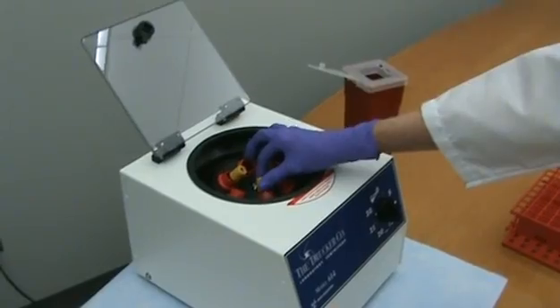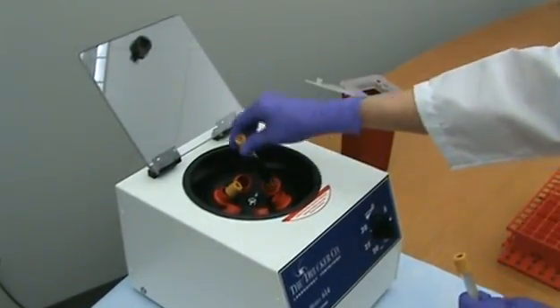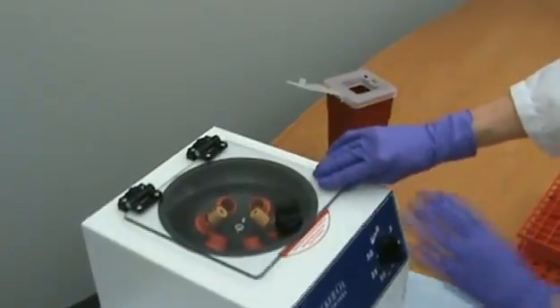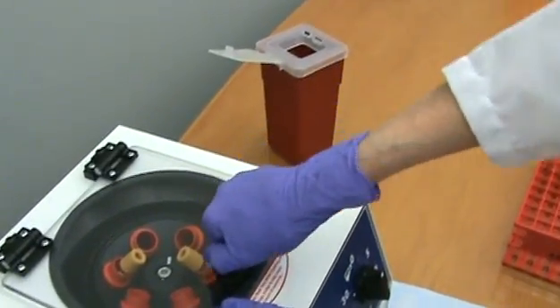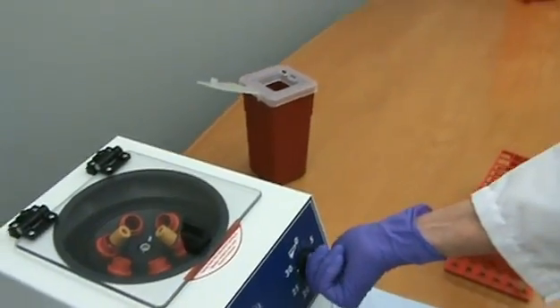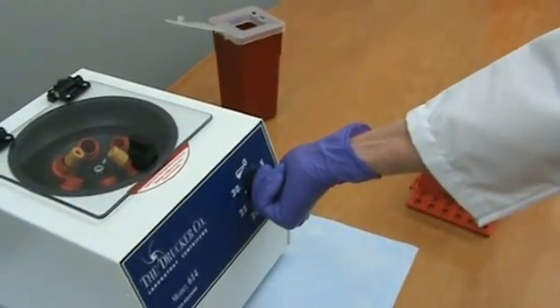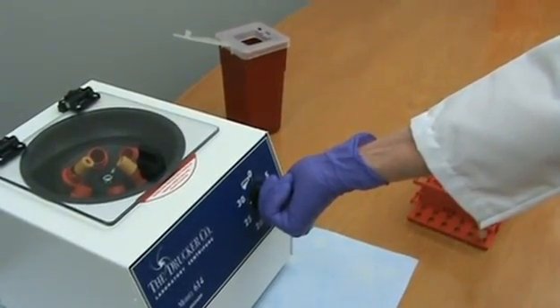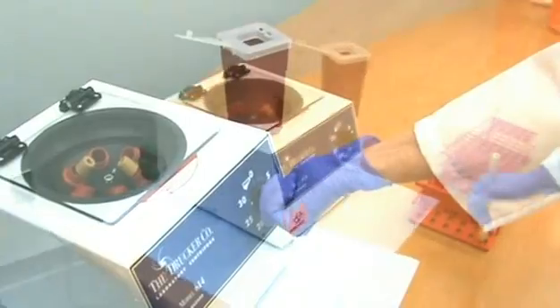Once the centrifuge is properly balanced, close the lid and ensure it is latched completely. The correct spinning conditions for centrifuging serum specimens is 1100 to 1300 RPMs for 15 minutes. Most clinical blood centrifuges spin only at one speed, so you would just need to turn the timer to 15 minutes to start the centrifuge.